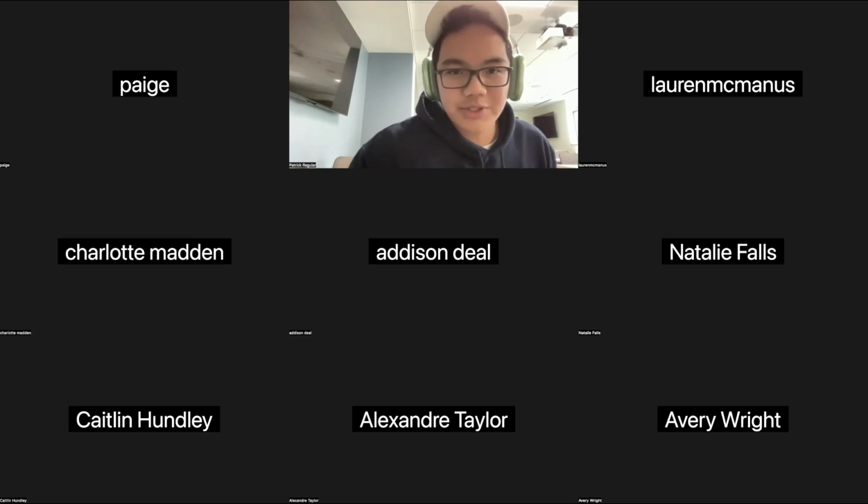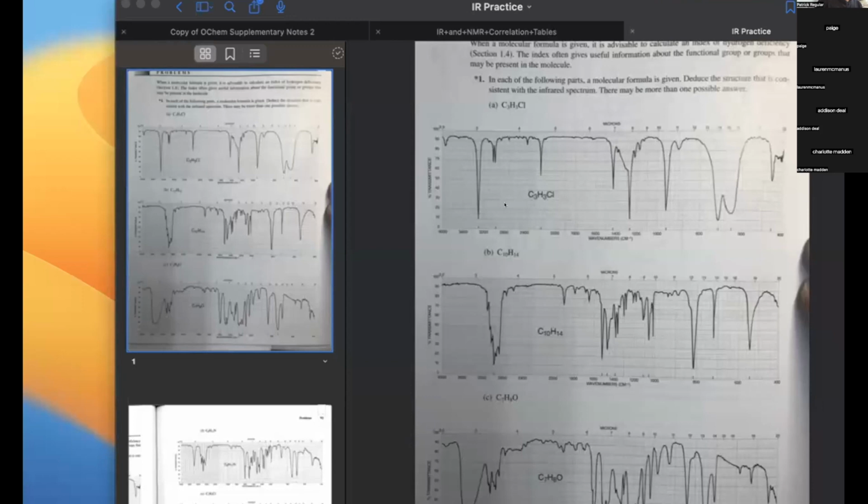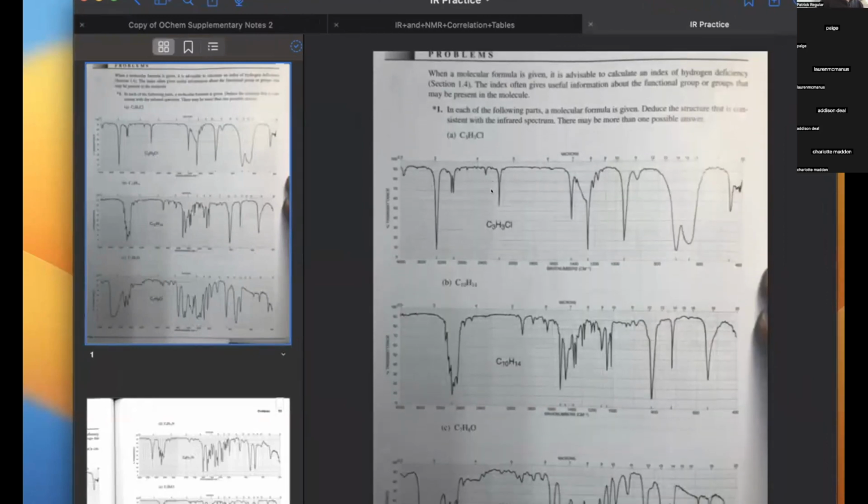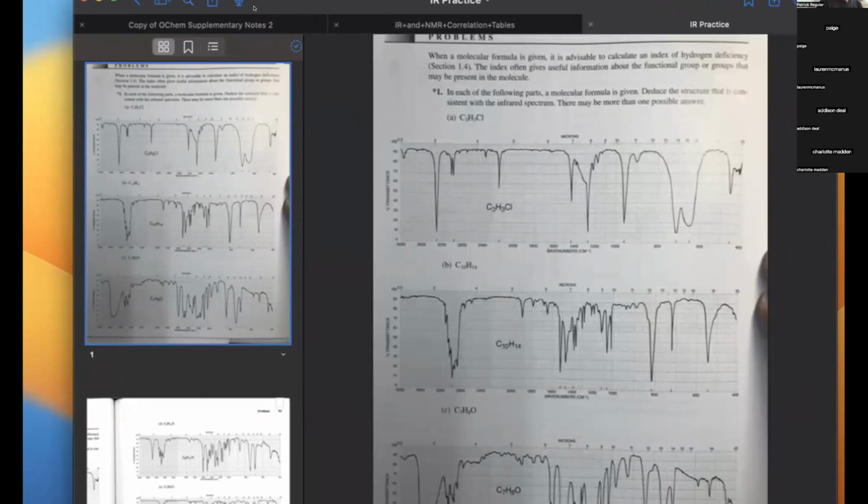Welcome to some IR practice. This is something last minute, just to really nail in the idea that we want you guys to practice this kind of stuff, and you should be practicing over spring break. Do you guys see my shared screen?